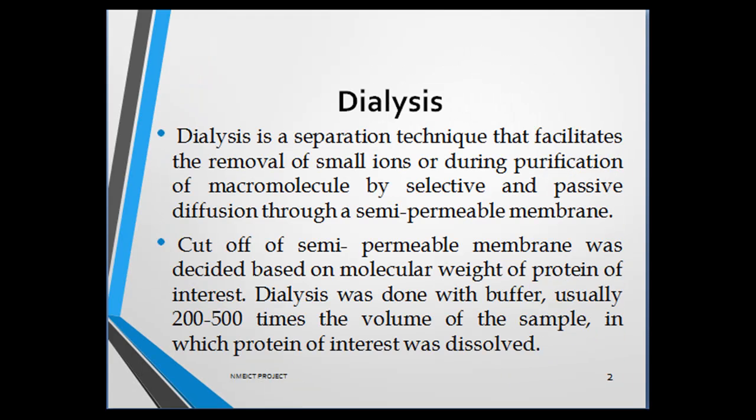Dialysis is a separation technique that facilitates the removal of small ions during purification of macromolecules by selective and passive diffusion through a semi-permeable membrane. The cutoff of this semi-permeable membrane can be decided based on the molecular weight of the protein of interest. Dialysis is done with buffer, which is usually 200 to 500 times the volume of the sample in which the protein of interest is dissolved.